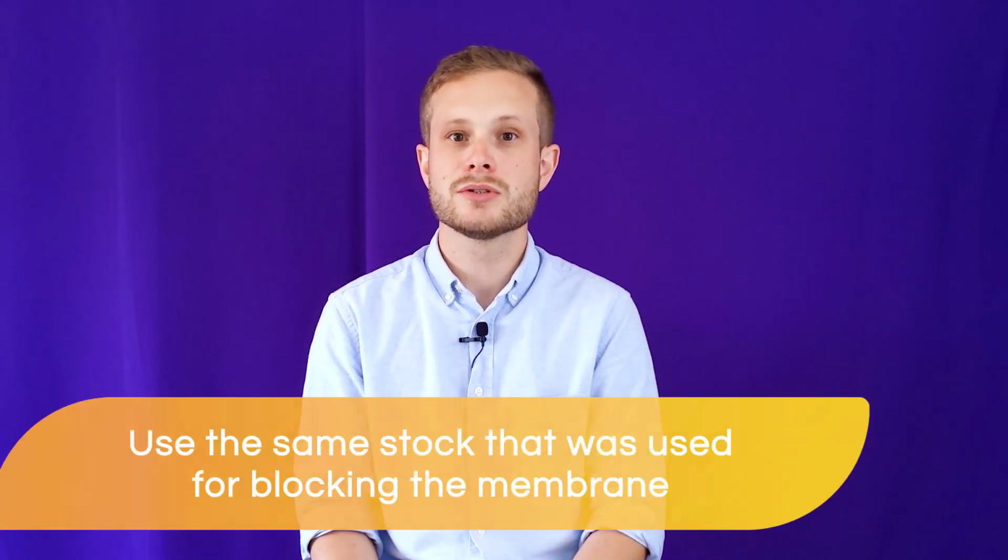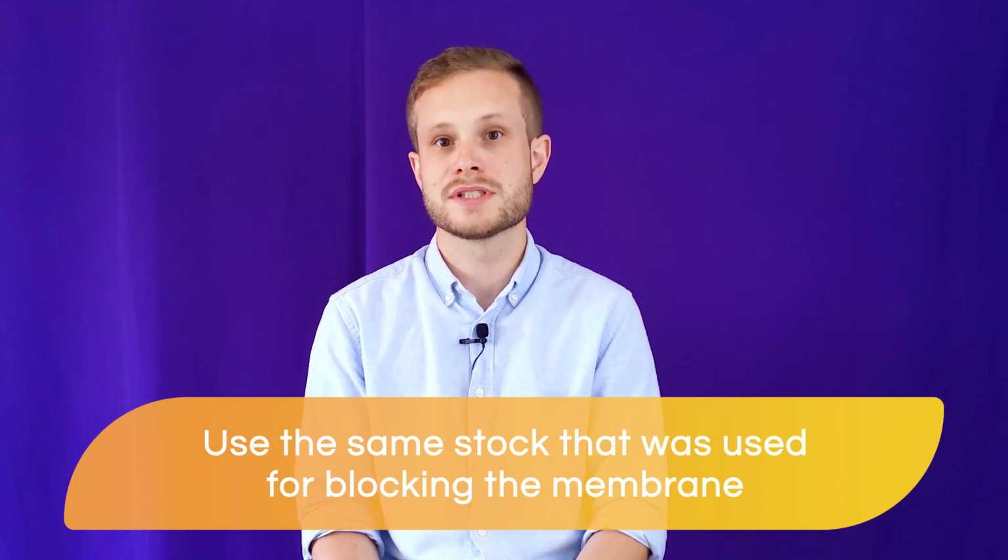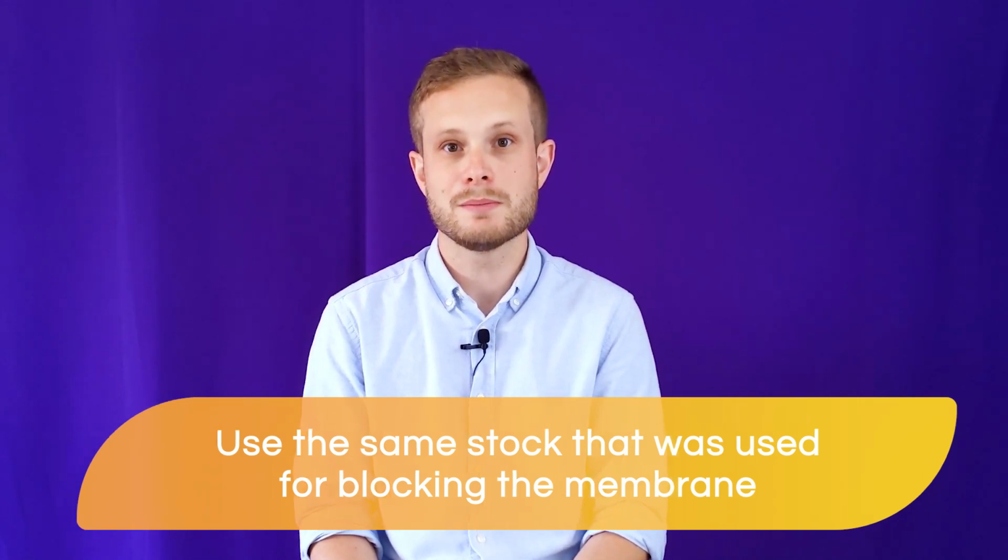Now that you have chosen and validated your primary antibody, you are ready to proceed to the primary antibody incubation step, which takes place after the blocking step has been completed. First, you will need to dilute your chosen antibody in fresh blocking solution to achieve the concentration recommended by the antibody vendor for Western blot applications, making sure that the blocking solution is taken from the same stock that was used for blocking the membrane.